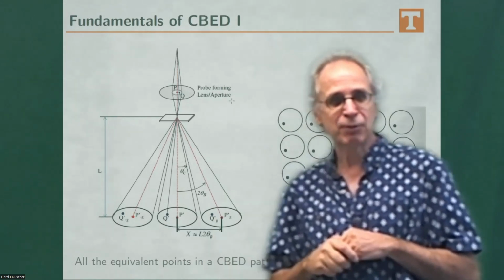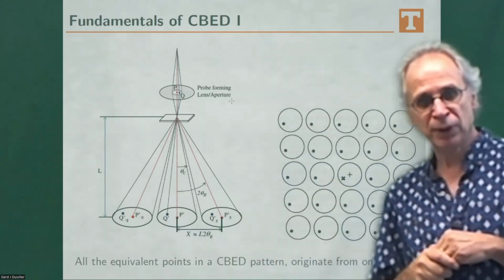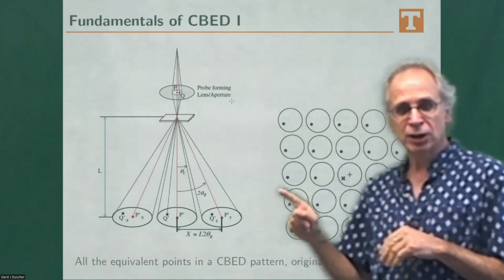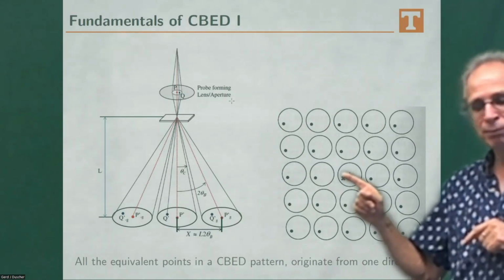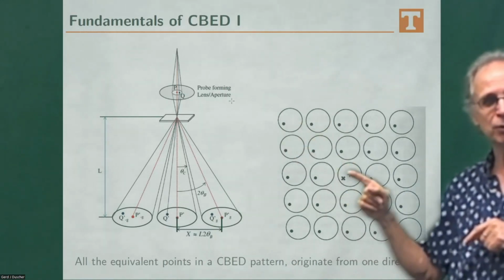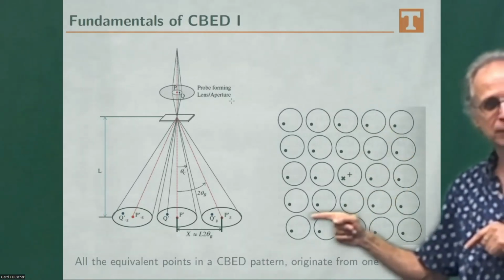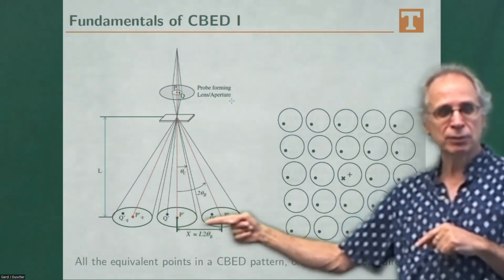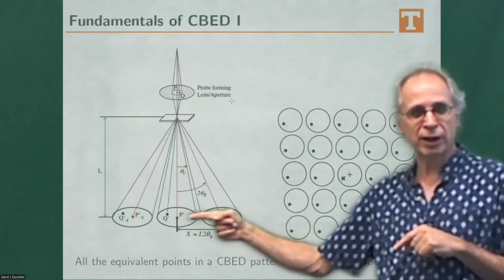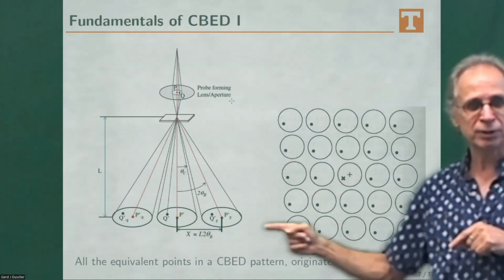The next thing that we have to do is look into convergent beam electron diffraction. If we come into the sample with only one angle, then we get a spot pattern. If we come in straight, then we have one in the middle, and all the middles are from one spot, right?